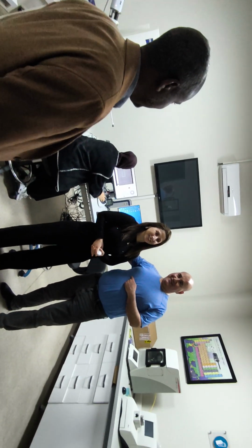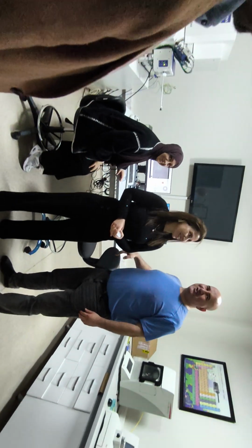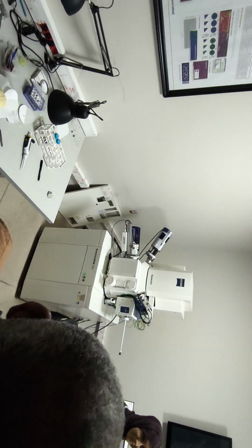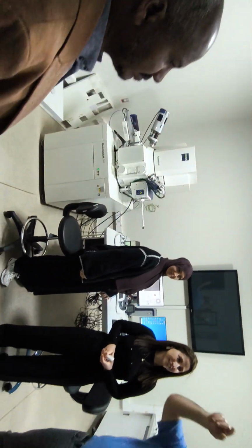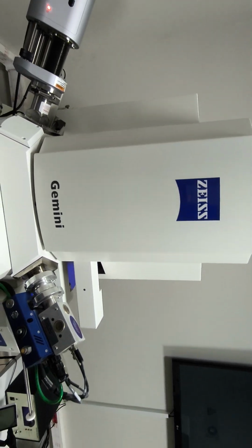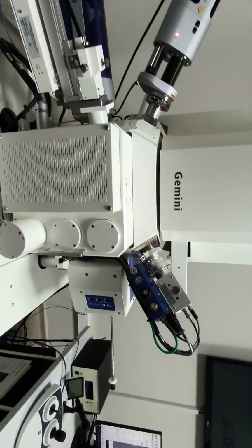She is our vice director here, and she also works with this device. This device is, how can we say, the Ferrari or Lamborghini. The other one is a small car, a Volkswagen. This one is the Lamborghini. There are just three devices like this one in Turkey.